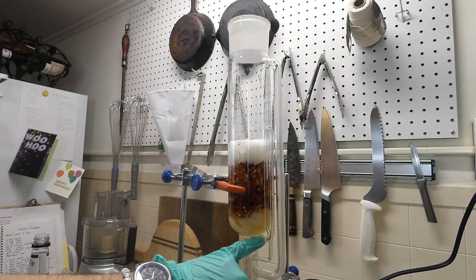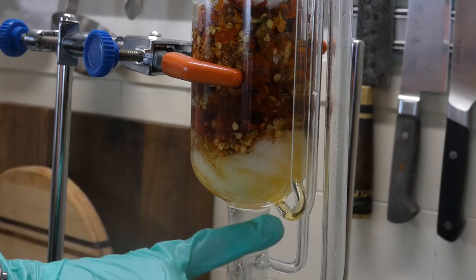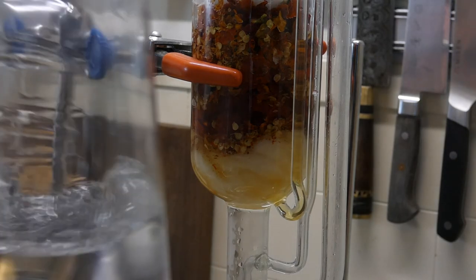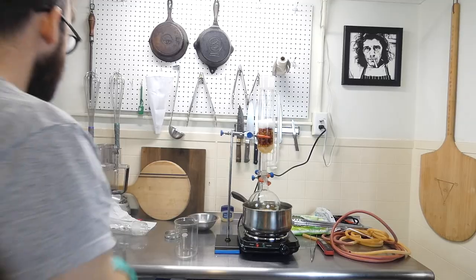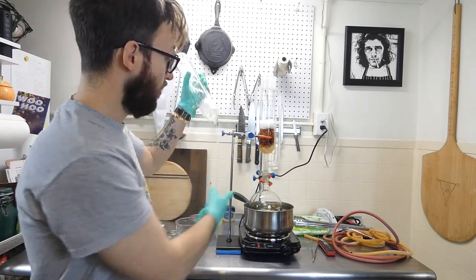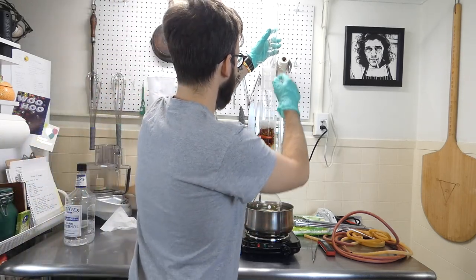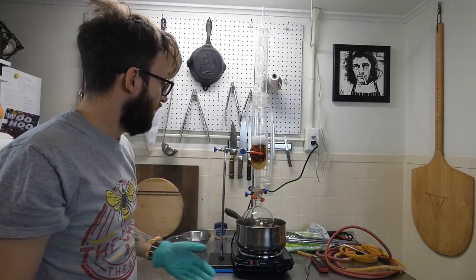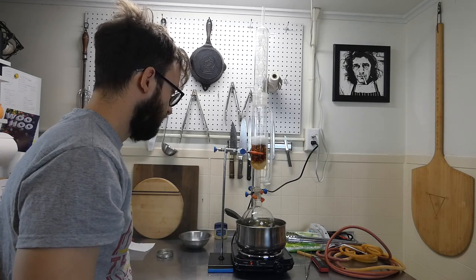All right, as you can see, it started coming up this arm. You'll see that the color is a little darker than the original ethanol. See? All right, so now all that's left to do is put this on, grease this up just like you did with this joint. Set it on top here, give it a little spin. All right, so that is the full setup for the Soxhlet extraction.